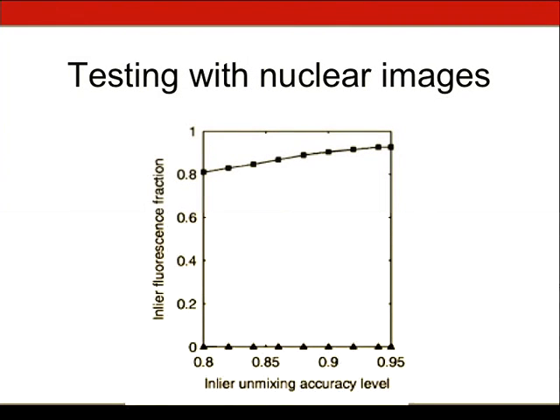And so this just shows you that using this type of test, this is the accuracy of unmixing the mito and lyso data that we just looked at.